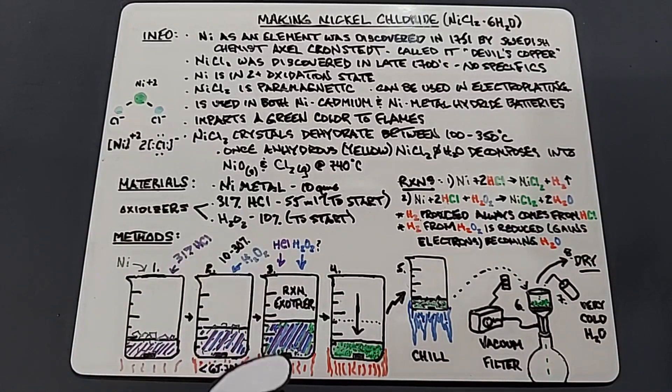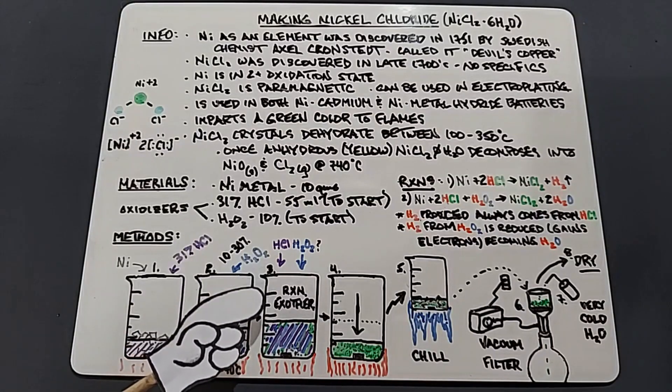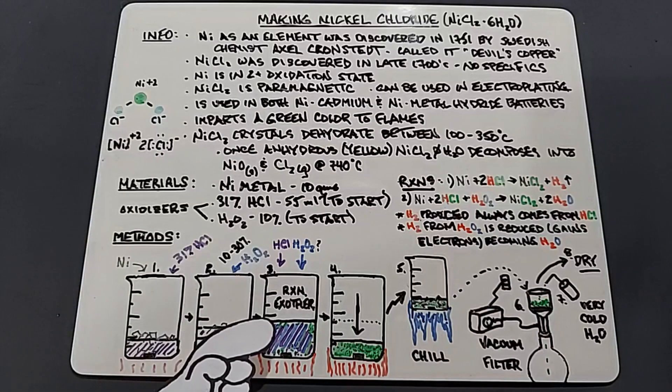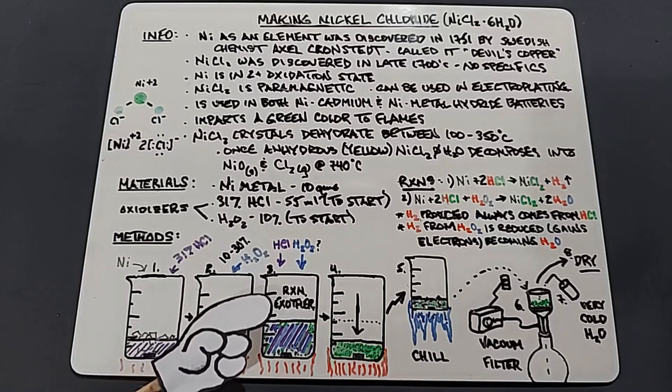As the experiment continues, we'll add the hydrochloric acid or the hydrogen peroxide as needed until we can get all of the nickel dissolved. Again, we're using heat. The reaction itself is exothermic, so even though you want to keep the temperature lower, if it starts to break down quickly even without heat, this will heat up sometimes to 80-90 degrees Celsius and you can't do anything about that—it's just part of the reaction.